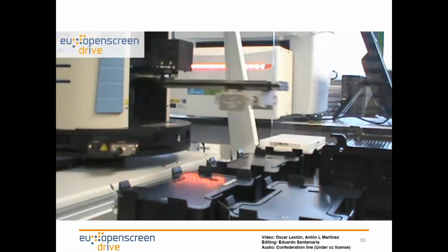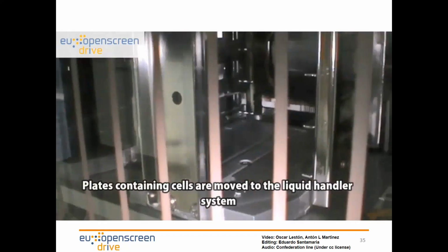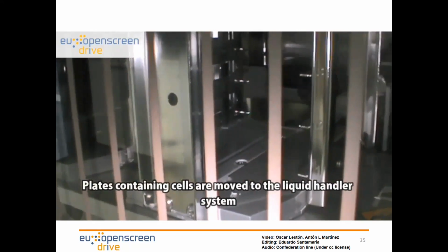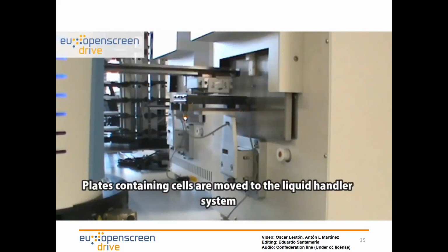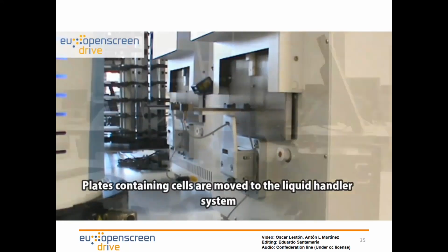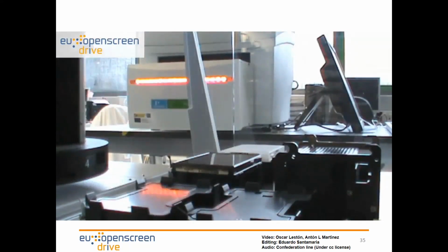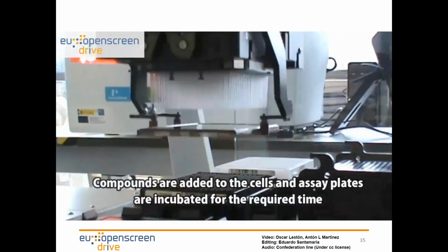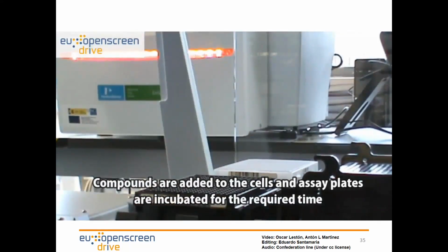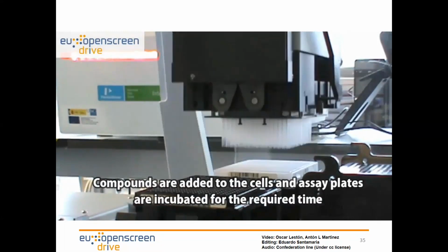The compounds are moved to the liquid handler, and everything, as you may see, is fully automated in order to process several plates at a time. The cells are taken out from the incubator, and the robotic arm takes the plate with the cells from the incubator and moves it to the liquid handler. Once the cells are on the liquid handler, it takes off the lid of the plate. Once the lid is removed, it is able to aspirate the compounds from the source plate and dispense the compounds into the cells.